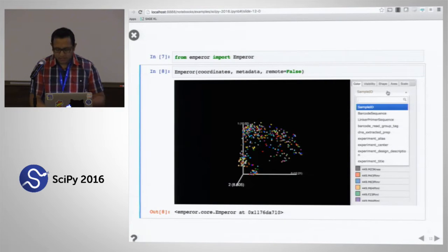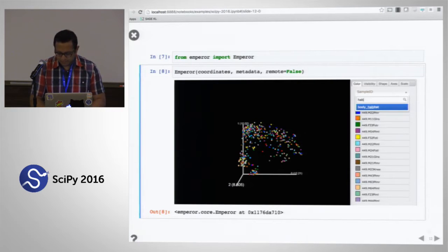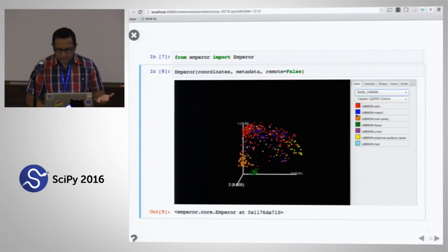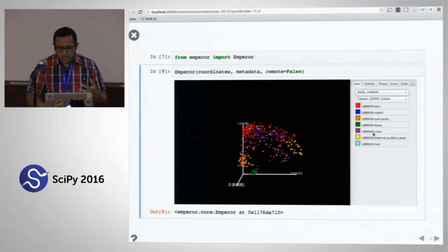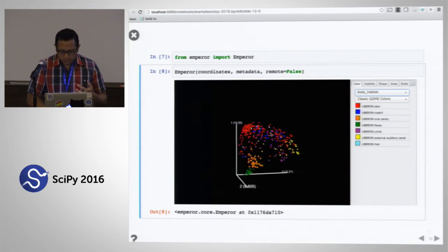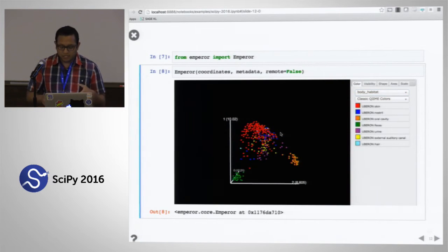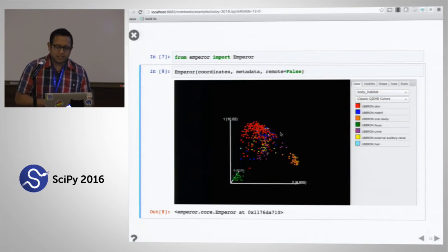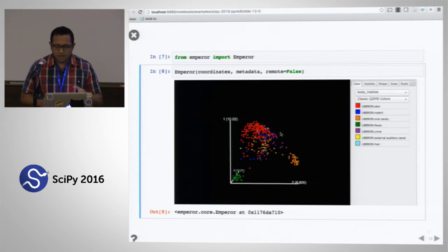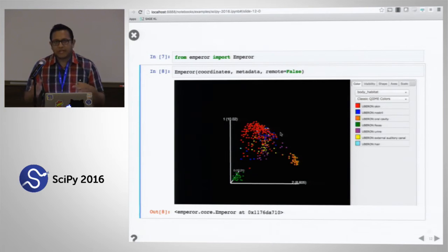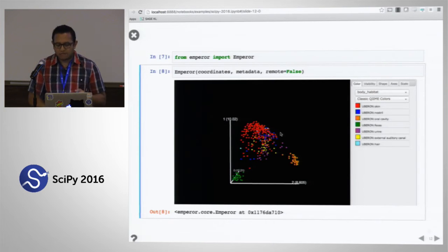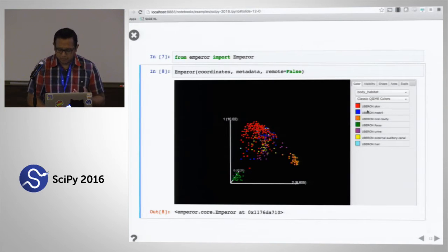Emperor is a JavaScript user interface powered by a Python API. With this interface I can start navigating through my metadata or data frame. I can look for something like body habitat and color each of the samples by the body habitat where that sample was collected, and we see the same pattern as before.